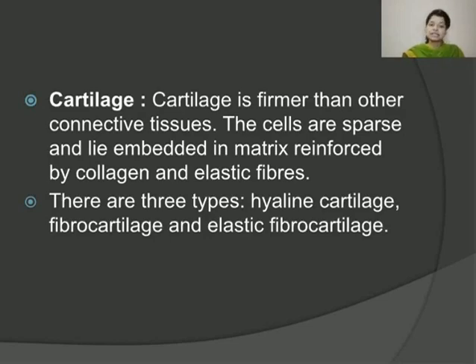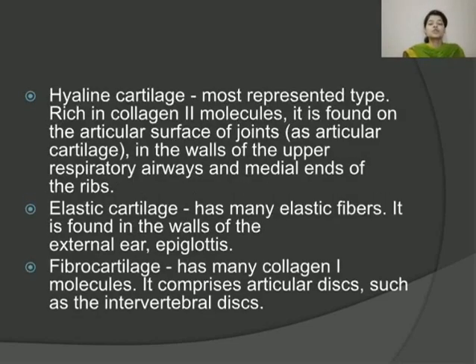being your elastic fibrocartilage. So hyaline cartilage is a smooth bluish white kind of tissue, and the chondrocytes are mainly arranged in small groups within cell nests, and the matrix is solid and smooth, right? Hyaline cartilage basically provides flexibility, support and a smooth surface for movements of the joints. It is mainly present on the ends of long bones, and it is also present forming the costal cartilage which attaches the ribs to the sternum.